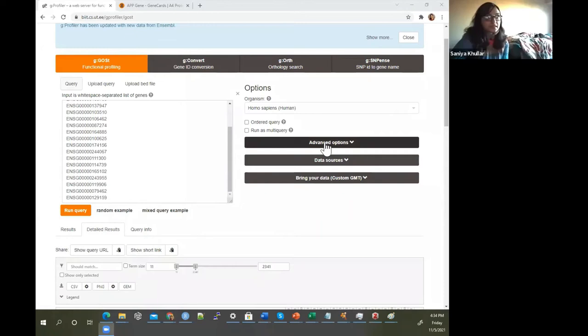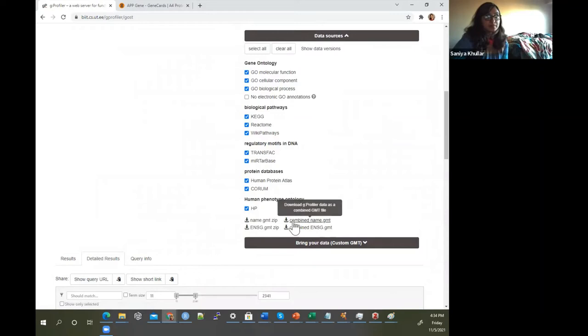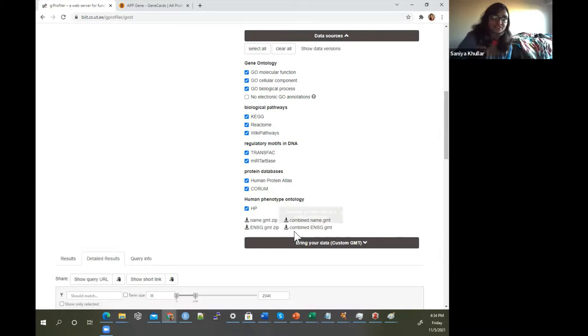Another key thing you can do is check the Advanced settings, where you can change some parameters. If you want to download data sources, you can download them as GMT files. I'll show in other videos how you can use GMT files for other analysis — if you're doing programming or just want to see what genes are in these gene lists, you can download them and use programming packages or other tools to open them.